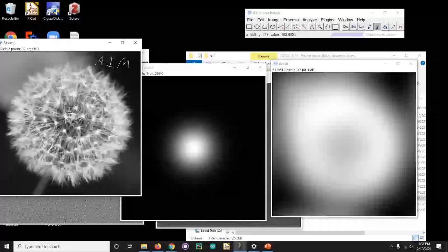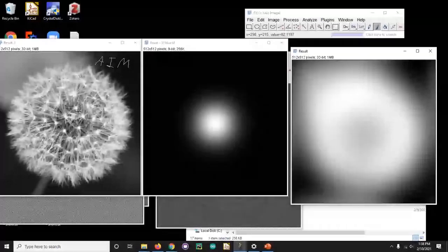So usually when people are doing deconvolutions, they're doing what's called an iterative deconvolution, which is effectively a computer trying to guess what the original point spread function was based on the feature space in the original image. So that's why you have to be really careful. Same thing with using deep learning: if you over iterate, it'll make your image look better and better, but that's a computer drawing something that looks subjectively good to you, but it's getting further and further away from what the original image was.